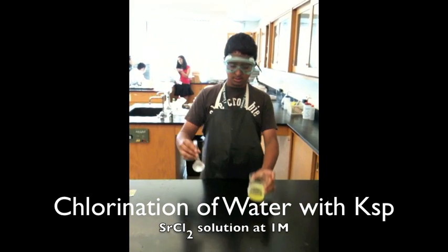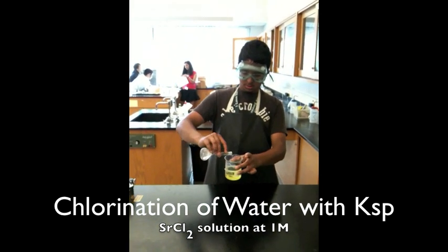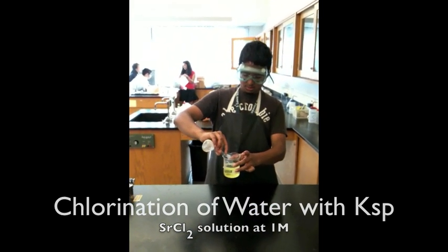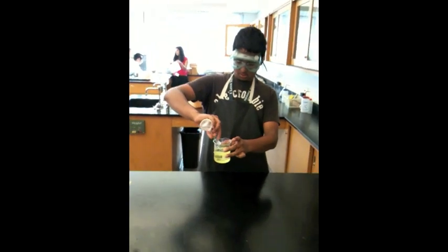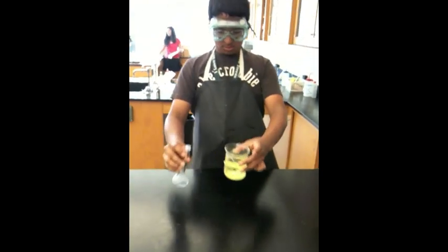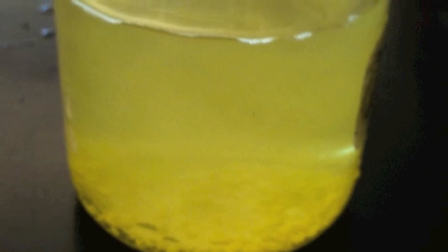Today, we face a problem of contaminated water. This water that we are experimenting with today is contaminated with the carcinogen, the chromate ion. While using the principles of Ksp, we will use the strontium ion to create the precipitate strontium chromate. With filtration, we will be able to filter out the chromate ion in the form of the solid and have clear water once again.